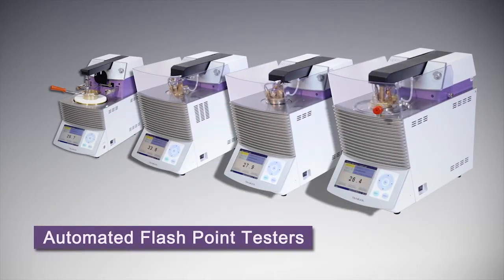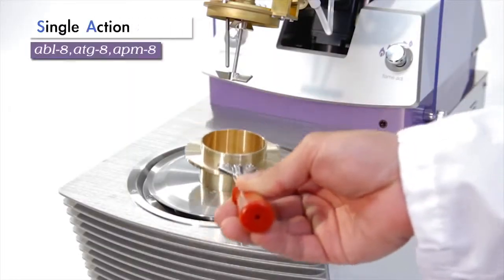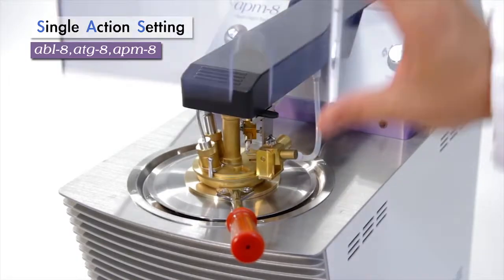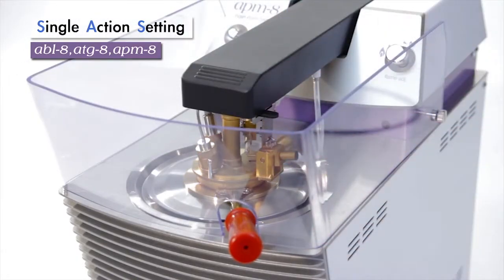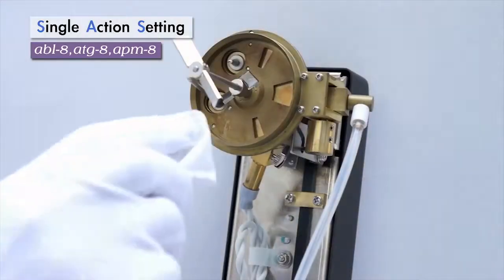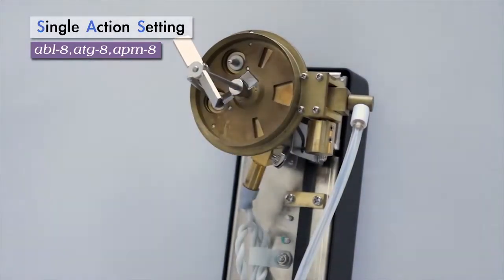Let us explain the features of the 8th series. The cup cover and stirrer are mounted on a swing arm, facilitating easy and safe handling of the test cup cover. The swing arm assembly can be raised to a vertical position, ensuring easier cleaning of the test cup.